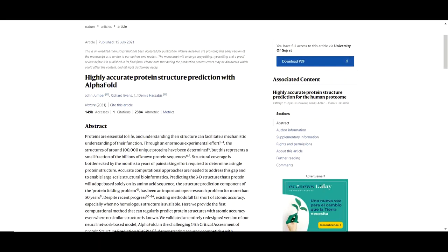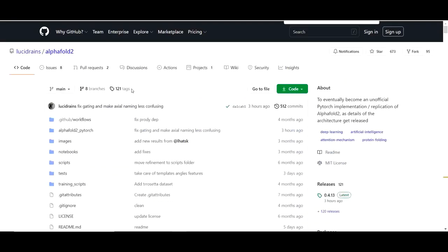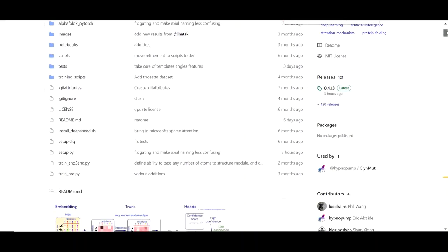On the 15th of July 2021, DeepMind published their groundbreaking paper in Nature describing AlphaFold 2 algorithm and also providing its code to all the scientific community. The code is available on GitHub. If you look at the code, you will find that you need to have very good computing power to run AlphaFold. For instance, you need to have one terabyte of hard disk to download the AlphaFold database.